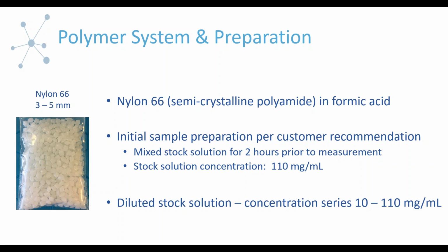Ultimately, we were interested in doing a serial dilution of the stock so that we could get a concentration variation in viscosity for this polymer. And then we could do some analysis, which we'll go over at the end. So we ultimately looked at between 10 and 110 milligrams per milliliter.